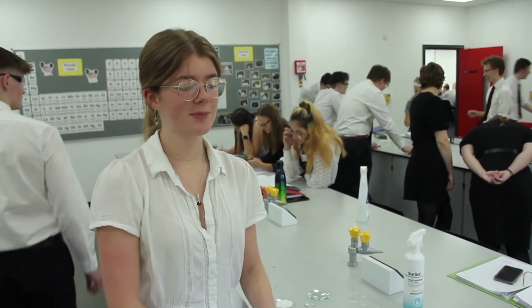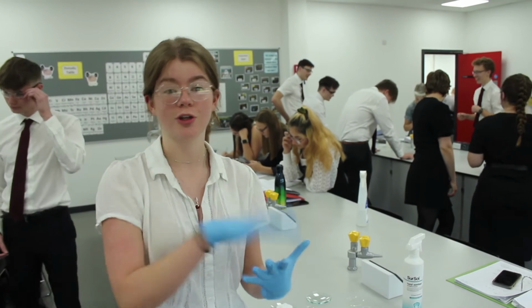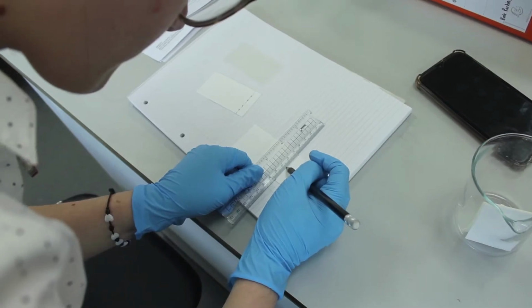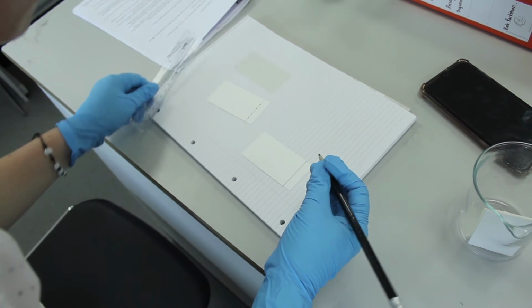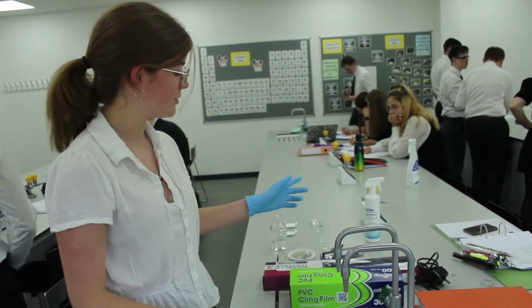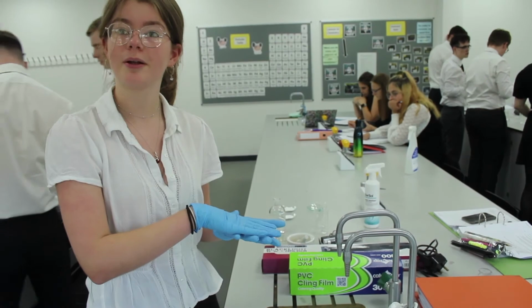In this part of the experiment, we are using chromatography to test the purity of the sample of aspirin we made compared to drugstore aspirin and our starting reactant. We use a thin layer chromatography plate, and we make 4 marks where we're going to put each of our samples, and then we pop it into a solvent, and the solvent separates the samples, so then we can compare them using either UV light or iodine to compare the samples to the pure aspirin.